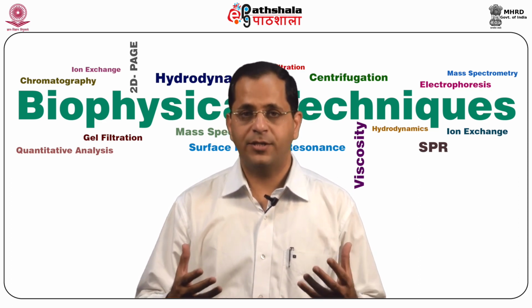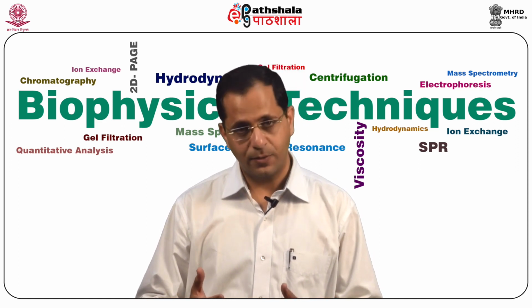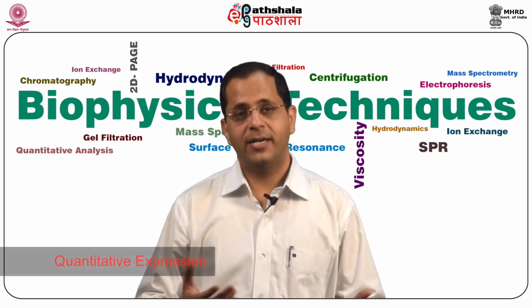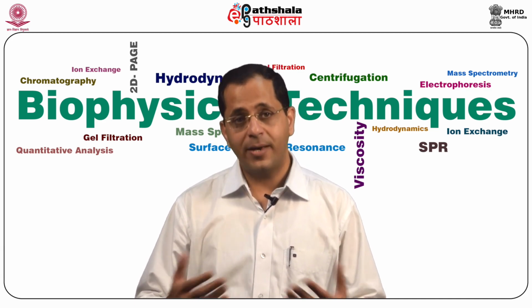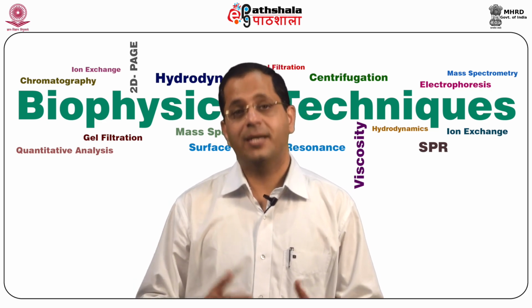So, what information would this give us? It will give us information pertaining to the pI of the protein, the molecular weight, and of course the quantitative expression, and if you are doing comparative proteomics, the relative expression between two phenotypic conditions.